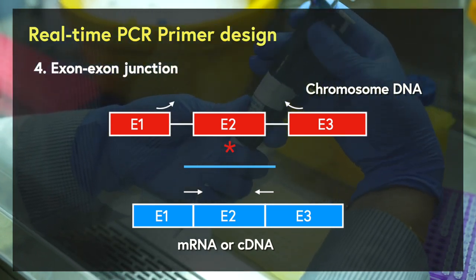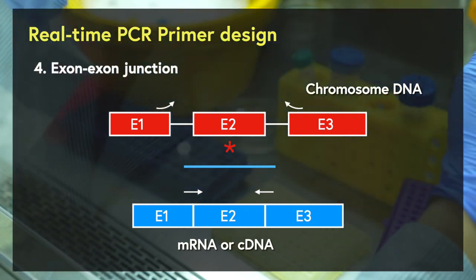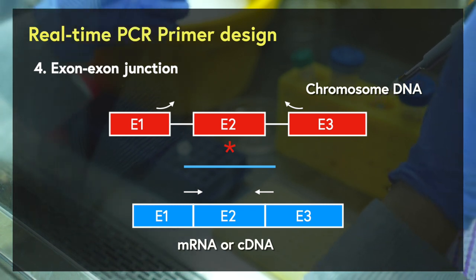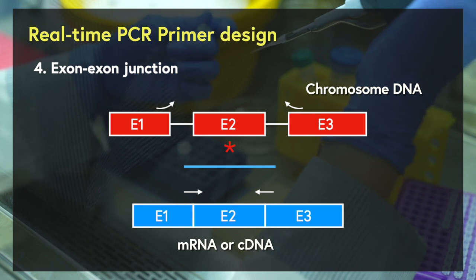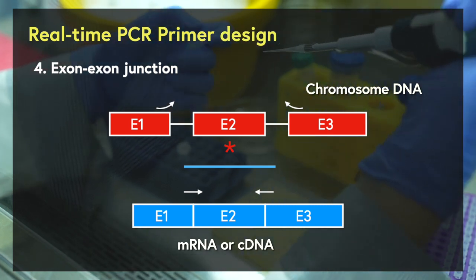But sometimes we don't have this ideal scenario. So at least you can make sure, if the gene you are going to amplify has at least one intron, you can design your forward primer between the exon-exon junction to cross the intron region. So now you know it is better to design primers that cross exon-exon junctions. Here I'm going to show you how to do the design using a gene with known mRNA and corresponding genomic DNA sequence.